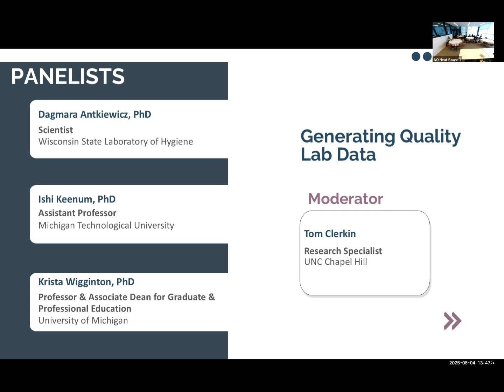Yeah. I'm Syed from Citizen Science. I have a question about the process control. Having a negative process control and a positive process control seems necessary if you want to make sure there's no contamination, and also want to make sure the entire process is working as you expected. What I found is that having a clean sample, like PBS or water, is not doing great as a control. You see a lot of false negatives. If you spike them and you process them, you will see it's not behaving like wastewater. That's one thing that I see.